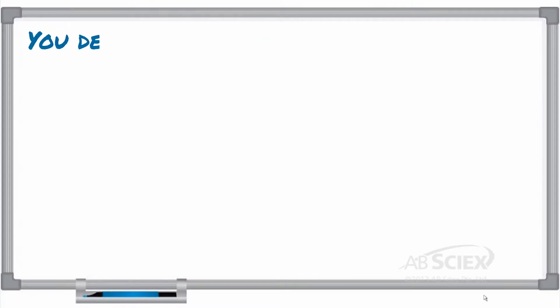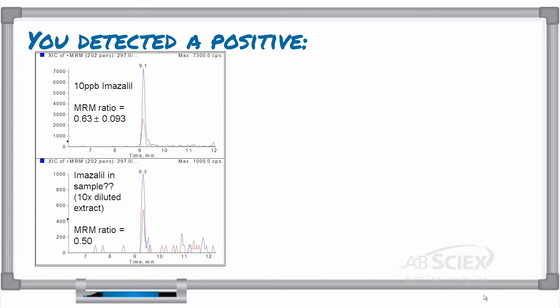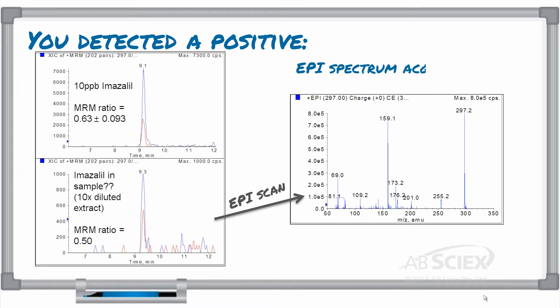So you've detected a residue or contaminant in your sample, and you want to review your MRM-triggered EPI scan data for ID confirmation. With Analyst Software, it's as easy as these six steps.